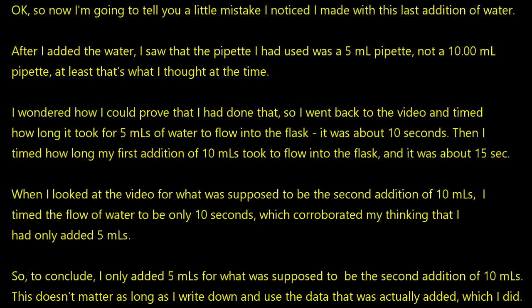Now I have a little bit of a confession to make. It was getting kind of late in the day when I was doing this experiment. I guess that's my excuse. But after I added the water, it was supposed to be 10 milliliters, but I had a 5 milliliter pipette under that hood as well. And I saw that the pipette I had used, at least I thought I had used, was the 5 milliliter pipette, not the 10. And so that was what I thought at the time.